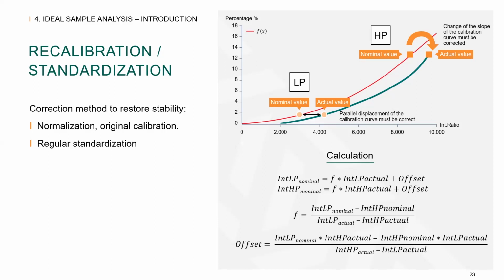Single-point recalibration methods cannot accurately account for both types of errors. In this image, the low point is corrected by bias and the top point is corrected by skew. These corrections modify the sensitivity of the spectrometer, therefore adjusting the calibration curve performance to match when the instrument was originally calibrated.